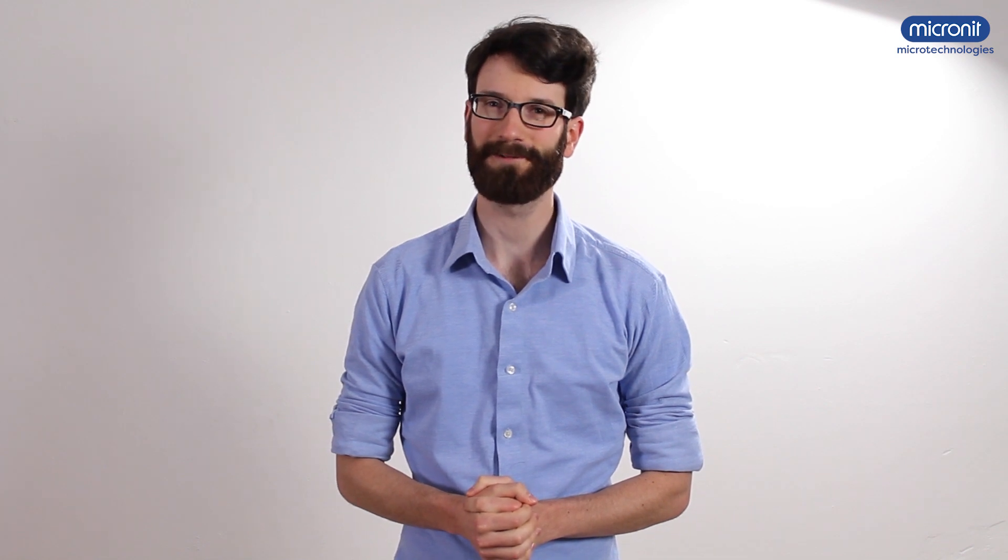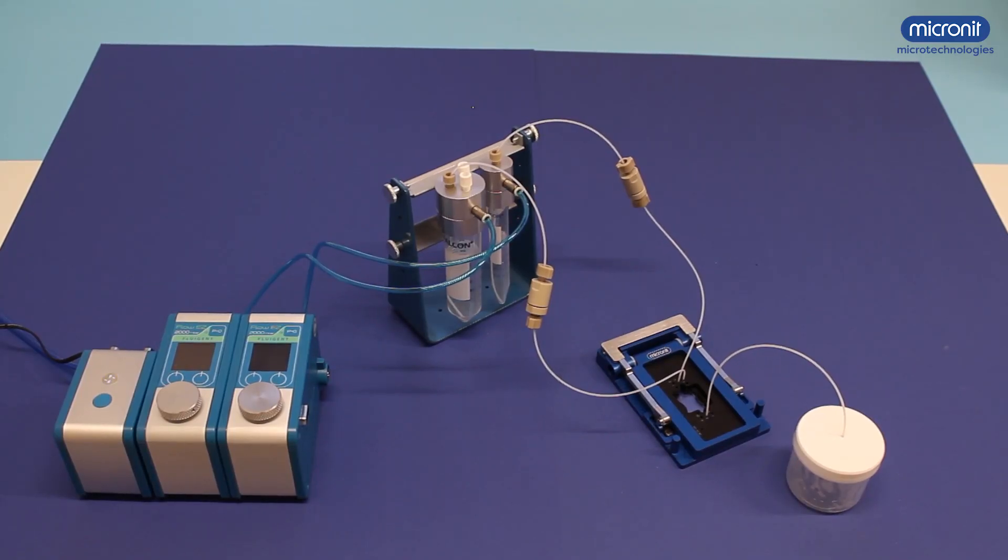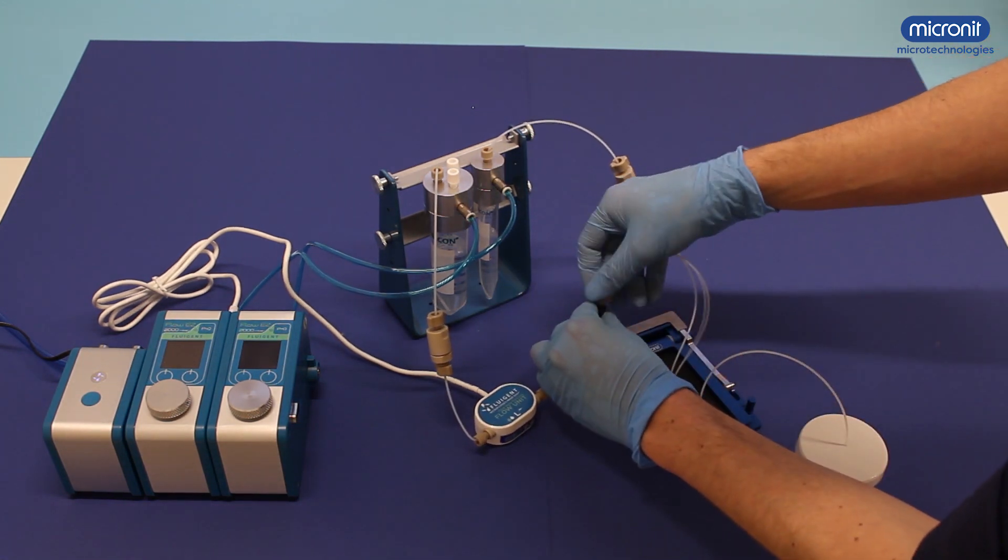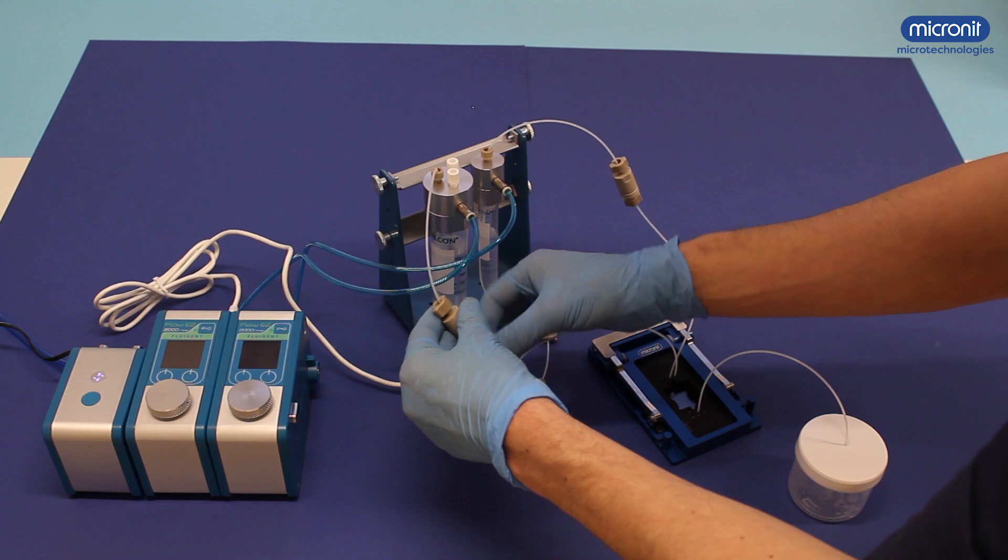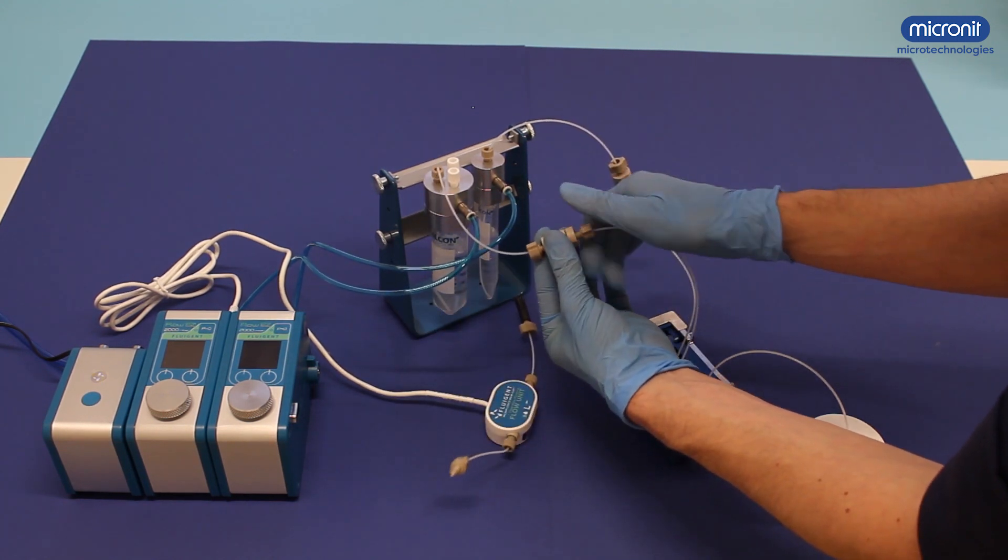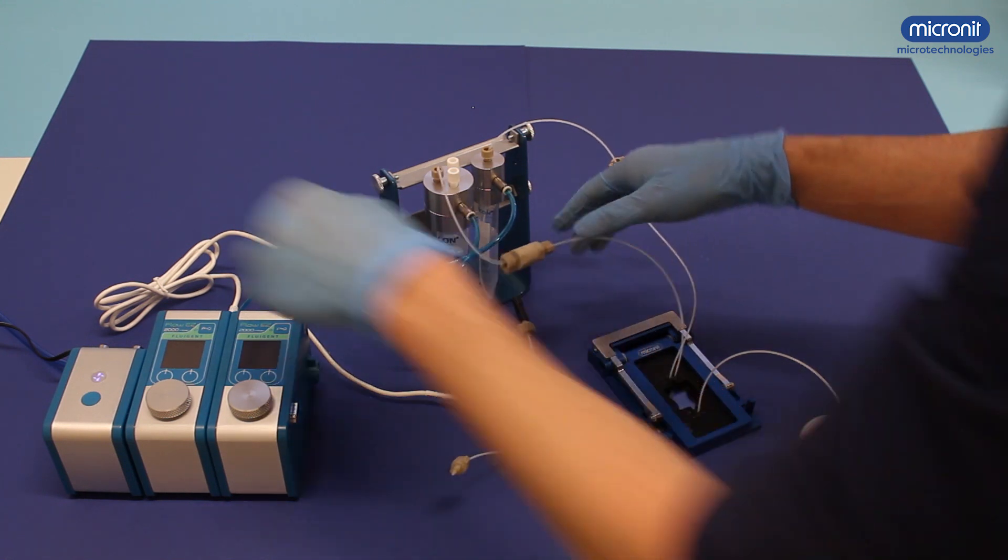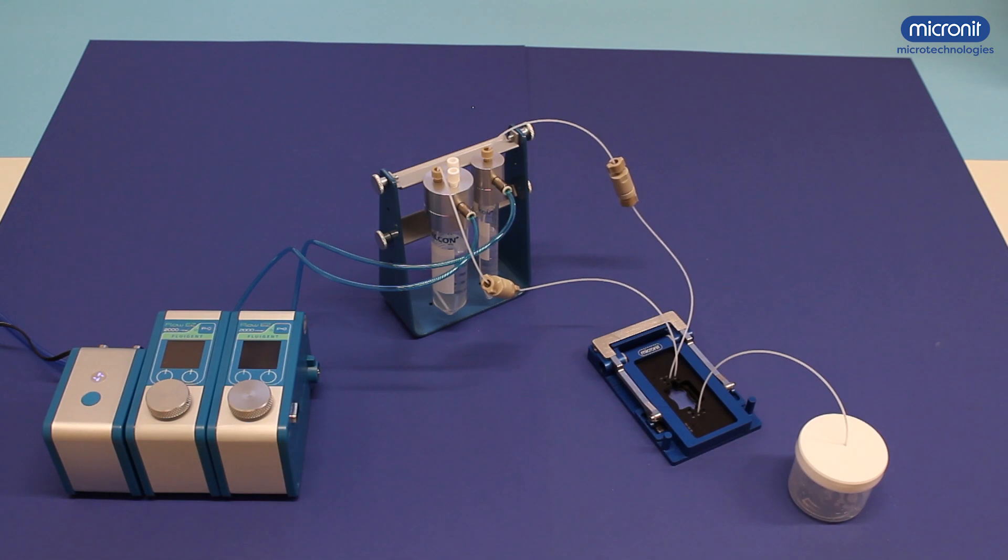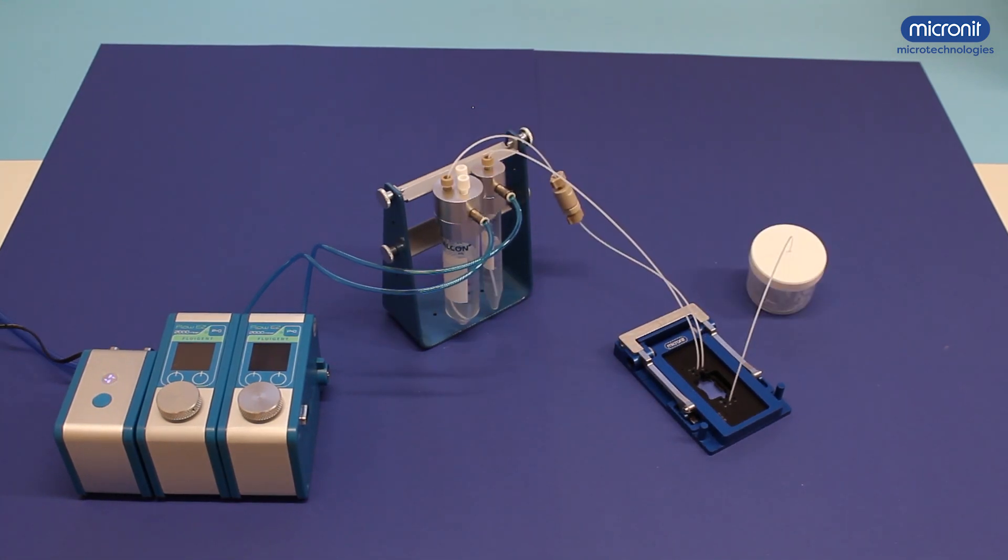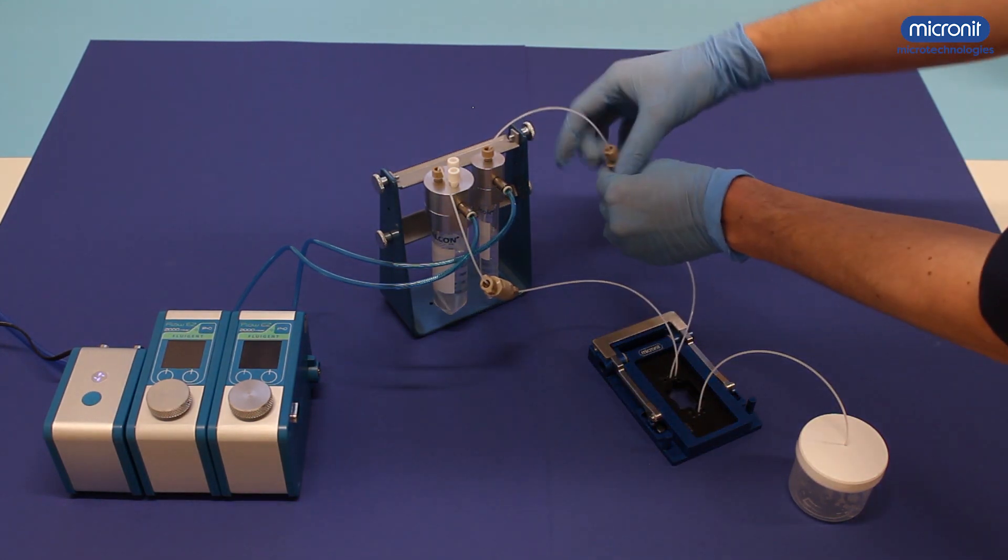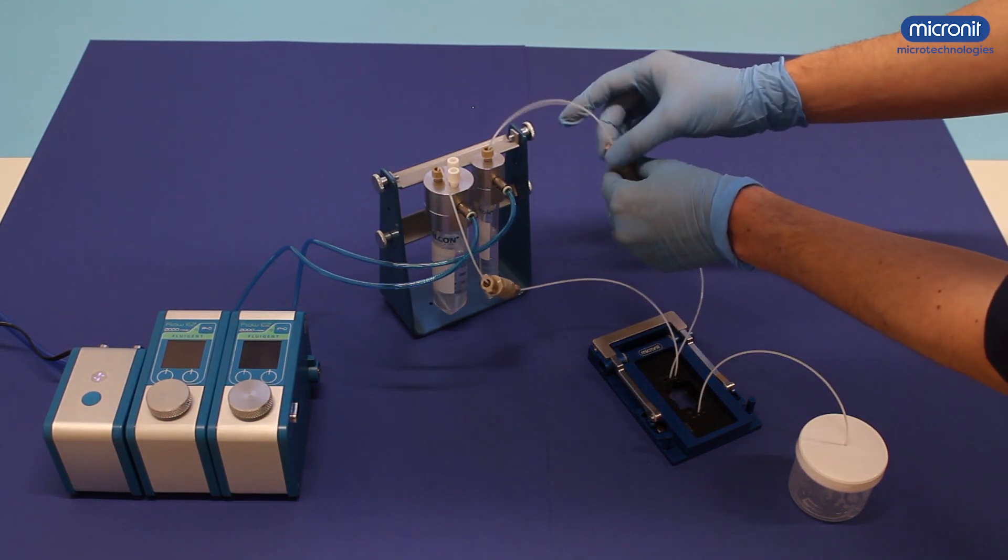Now let's play around with some other components that could be used. Here you have our setup again. This is what it would look like if you add a flow meter. And removing can be done as quick as this. You can also remove one filter, or both of them. Back to our original setup. Now let's exchange these pumps for syringe pumps.